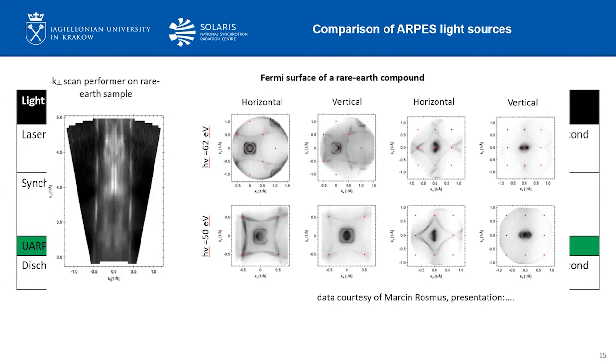But in recent years, high energy lasers suited for ARPES have also been developed, by taking advantage of nonlinear optical processes.